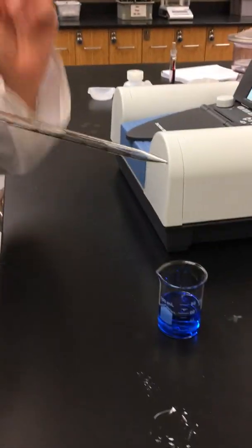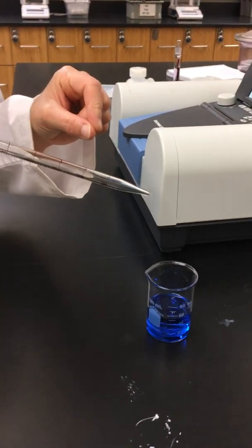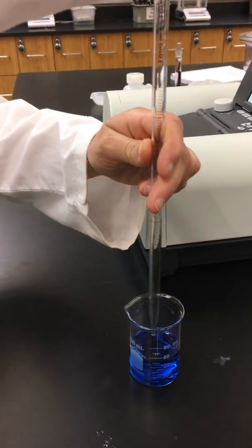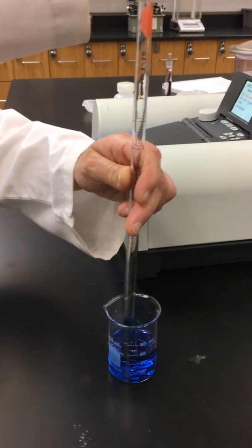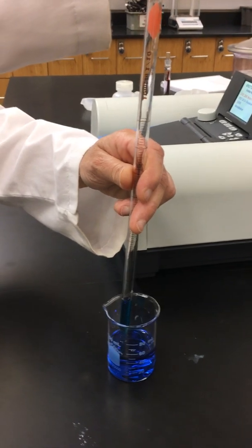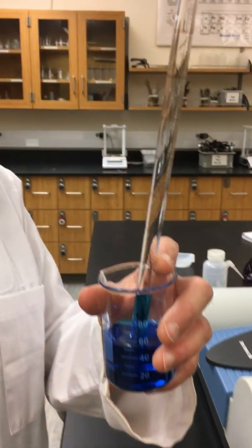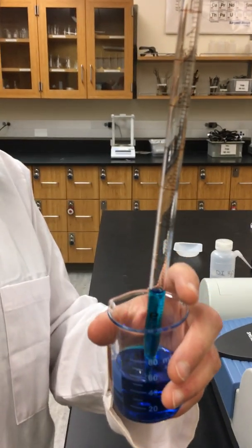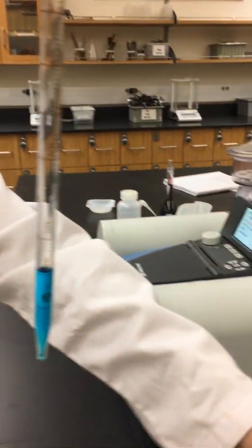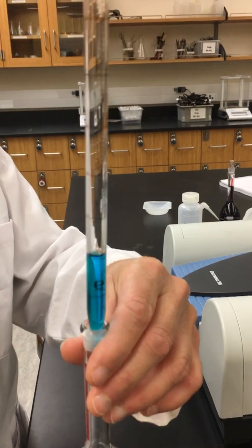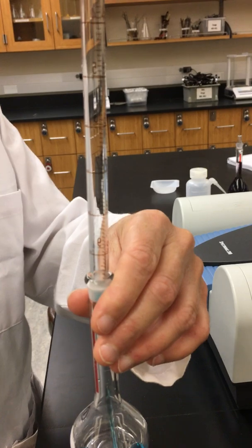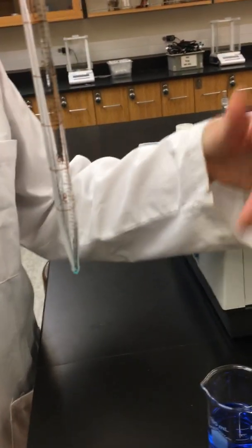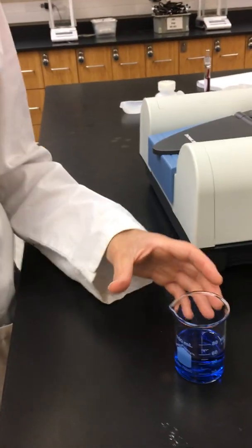Now we're going to be making 5 different dilutions of this. And so in our first one we're going to be adding 2 milliliters. Using my pipette I'm pulling up 2 milliliters and now we're going to add it to our first flask. And then we will be adding water after we do each one to bring it up to a total of 50 milliliters.